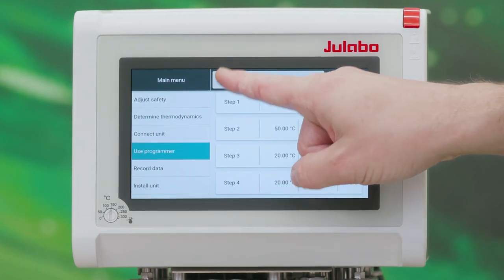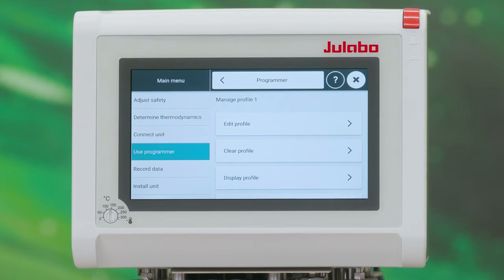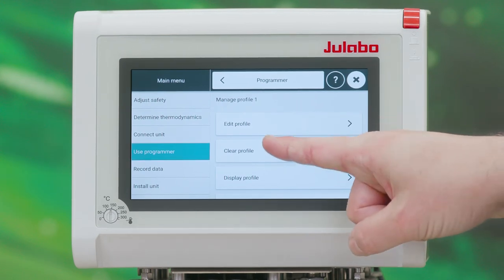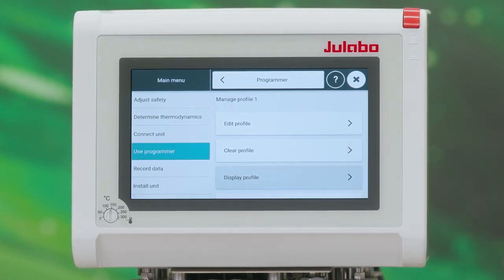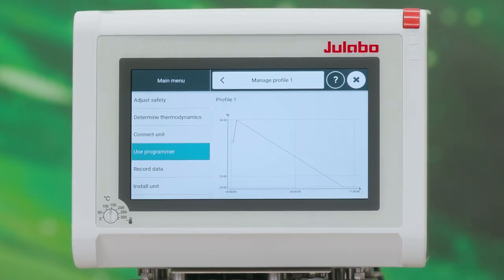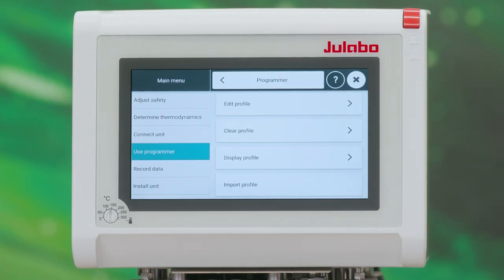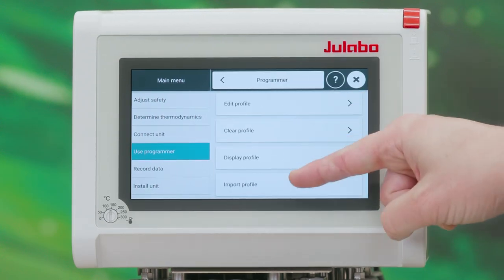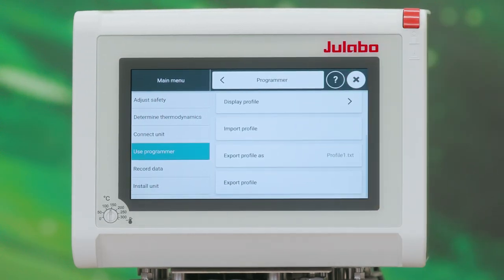Now you have different options to manage this profile. Naturally you can clear the profile. You can display the complete profile as a graph. And you can import or export a profile onto a USB stick.